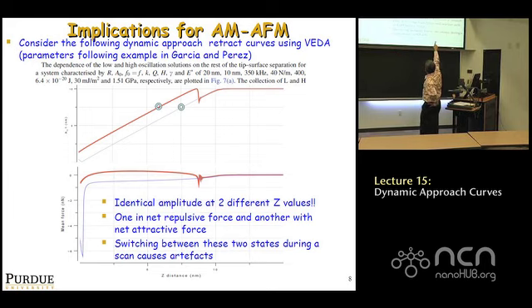You find out that when you approach, you're along the blue line and you have a negative net interaction force, or a net mean force. But when you move away from this, when you withdraw from the sample along the red curve, the interaction forces are mostly net repulsive. Okay? Positive forces are repulsive. Right? So this is what happens.